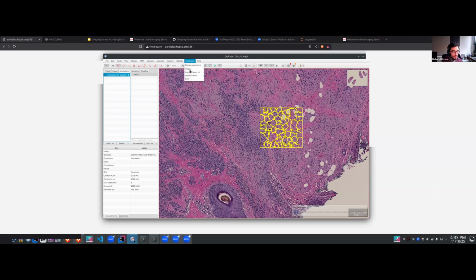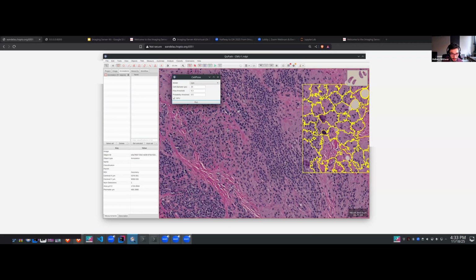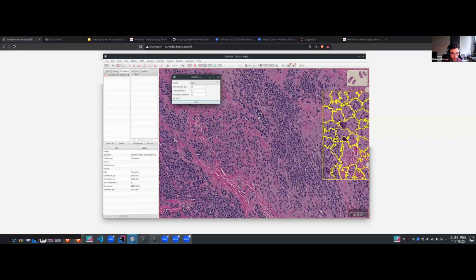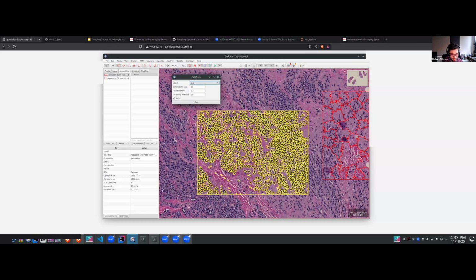And the effect of that is that we have updated the list of algorithms available currently. So in this case, we find cellpose. And now I'm clicking on cellpose, and I will do just like before. I will draw a little region of interest. I guess the Cyto model is fine, and I've ticked GPU. So I will just press run. Yeah, and there we go.